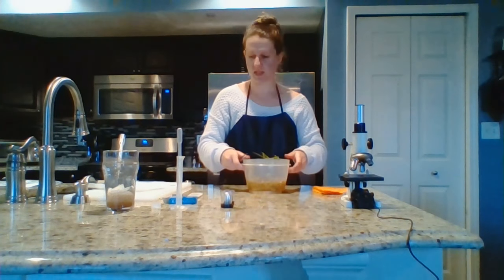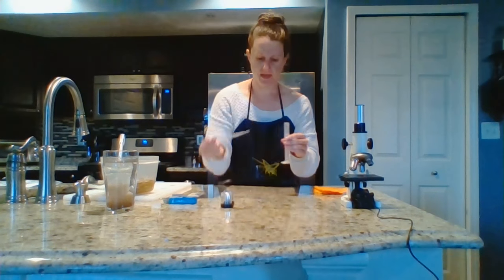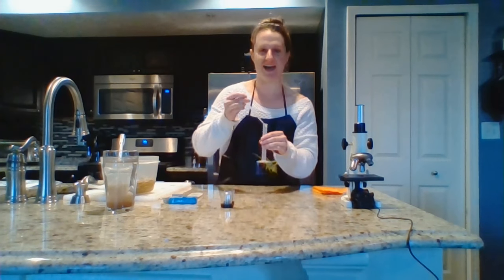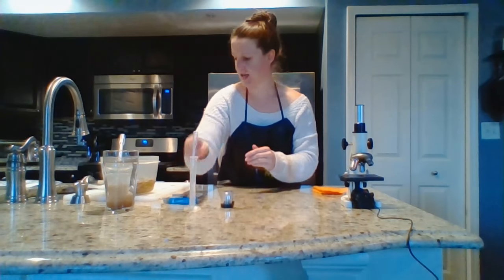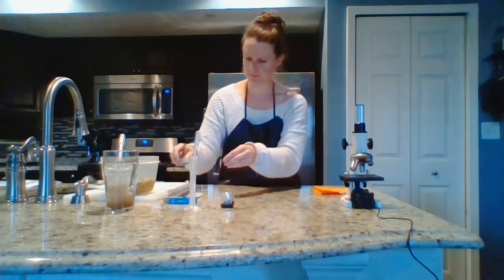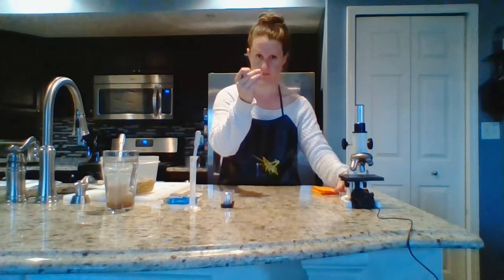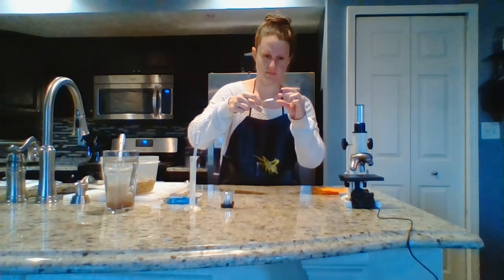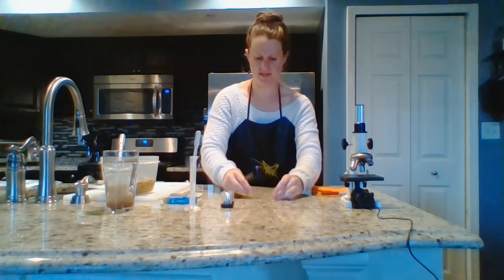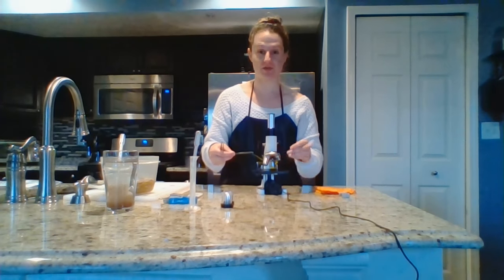Put it right there in the middle of the slide. Then just use some plain tap water and add a drop or two right on top of that hay. Then, once again, grab a cover slip and your forceps and just drop it onto the little piece of hay. Set that into your microscope.